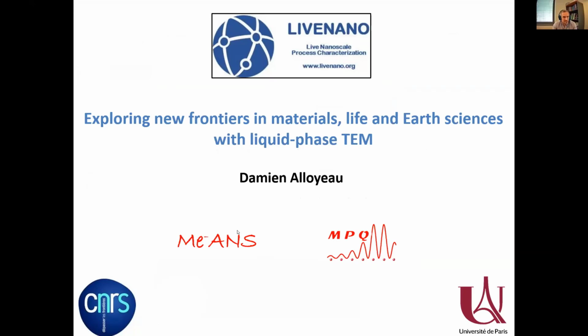I congratulate you also, Kristian, because I think that this LiveNano platform is a very nice initiative to generate new interdisciplinary synergies that are essential for liquid phase or more generally in situ analysis. So to stick to this idea, today the goal of my talk will be to illustrate the interdisciplinary potential of liquid phase TEM by showing you some applications of this technique in materials, life, and earth sciences.